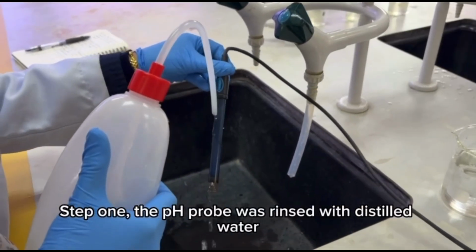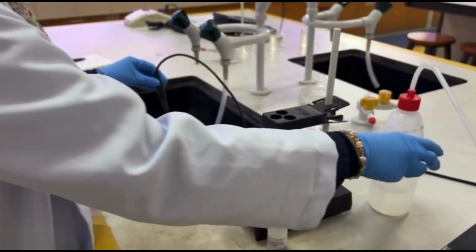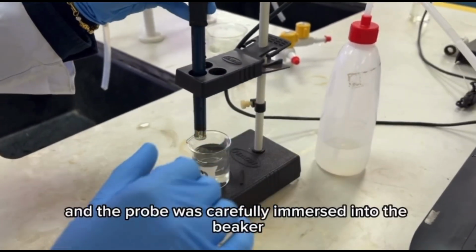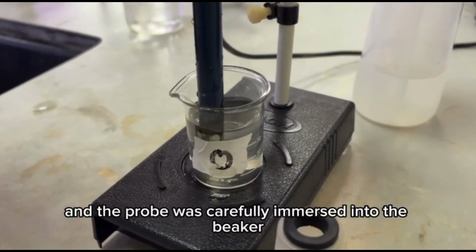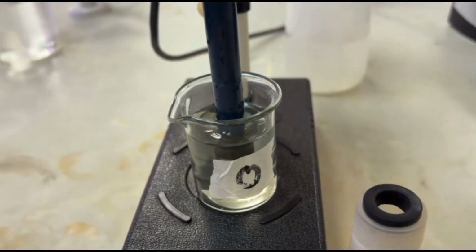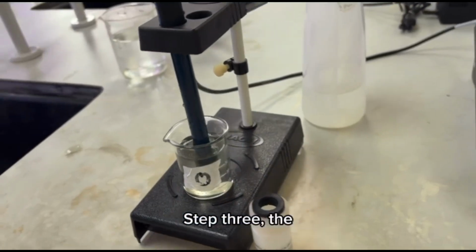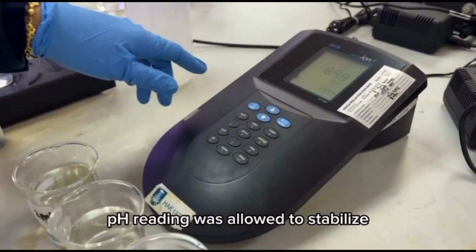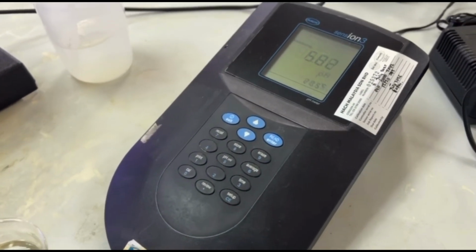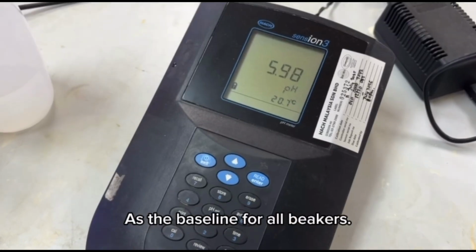Step 1. The pH probe was rinsed with distilled water to remove any contaminants prior to measurement. Step 2. The pH meter was switched on and the probe was carefully immersed into the beaker containing the raw water sample to measure the initial pH before the jar test. It was ensured that the sensing tip was fully submerged. Step 3. The pH reading was allowed to stabilize until a steady value was displayed and an indicator sound was heard. Step 4. The initial pH value was recorded in the table as the baseline for all beakers.